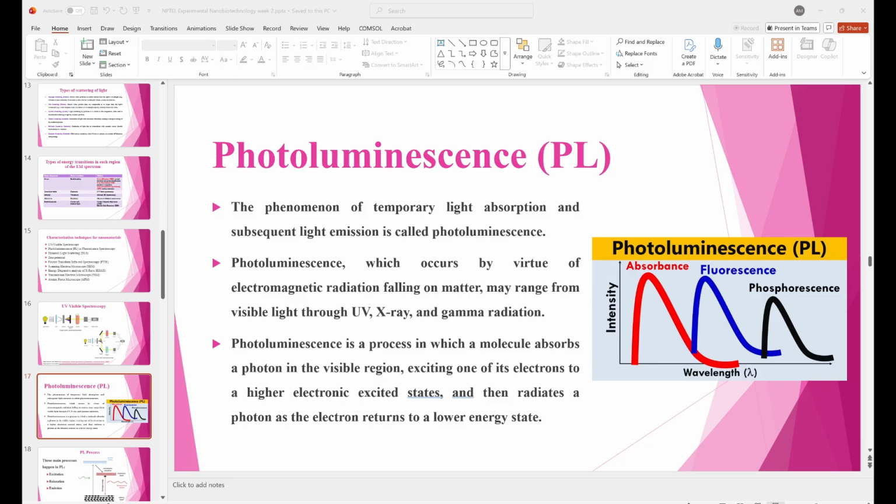The quantity of the emitted light is related to the relative contribution of the radiative process. Radiative transitions in semiconductors may also involve localized defects or impurity levels. Analysis of the PL spectrum leads to the identification of specific defects or impurities, and the magnitude of the PL signal allows determining their concentration. The respective rates of radiative and non-radiative recombination can be estimated from a careful analysis of the temperature variation of the PL intensity and PL decay time.